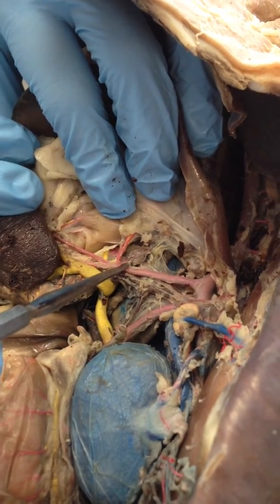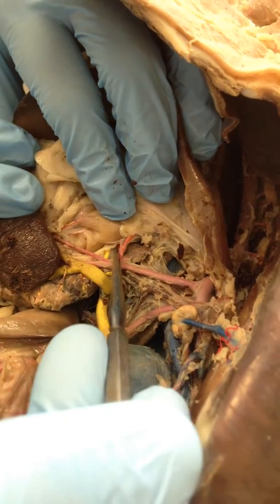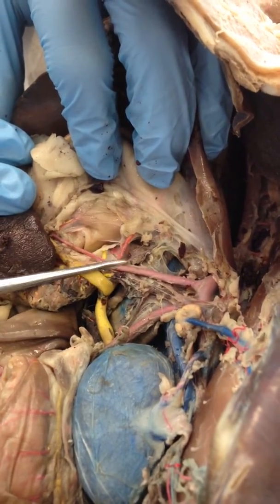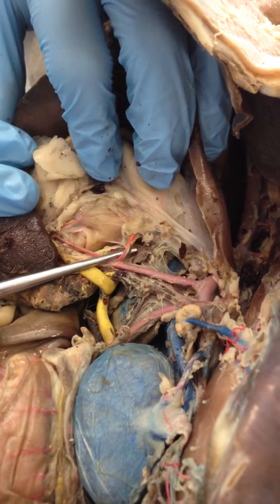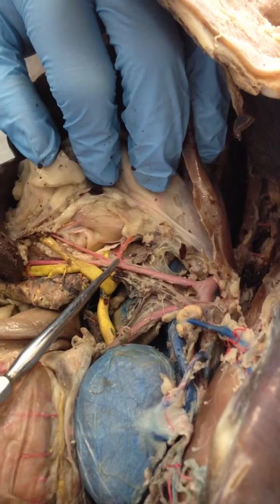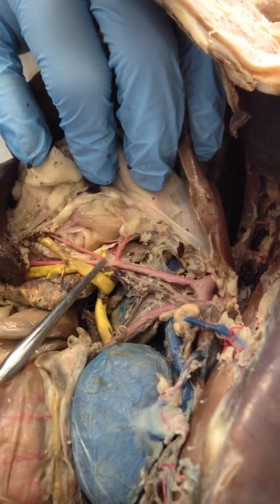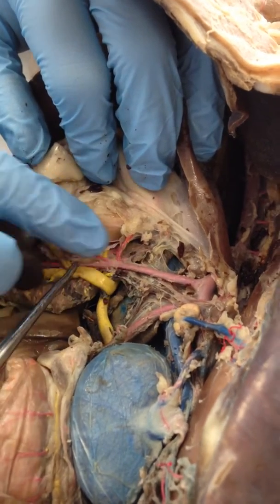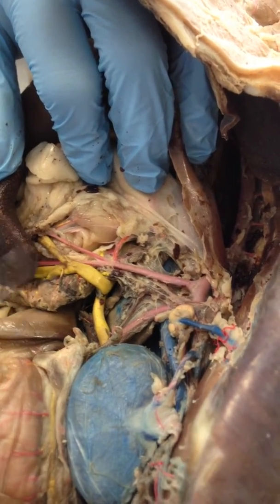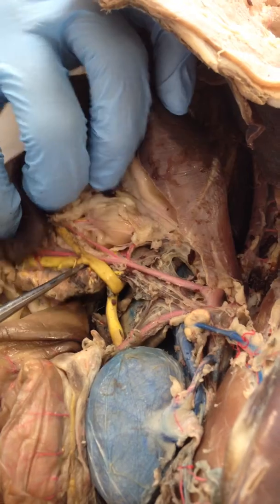They come out very close. That's the hepatic. It's going to go under the stomach and goes to the liver. These two are going to the stomach, and so these are both gastric. It split early. And technically, once this splits off, this trunk is now splenic. The fact it's split doesn't matter. It's splenic.